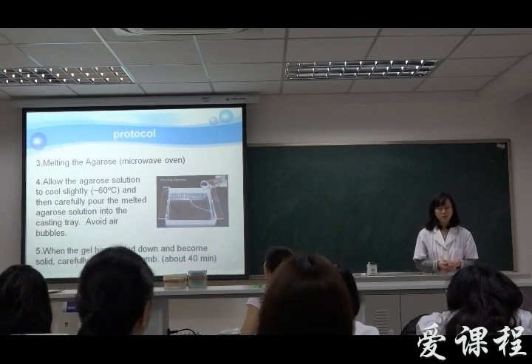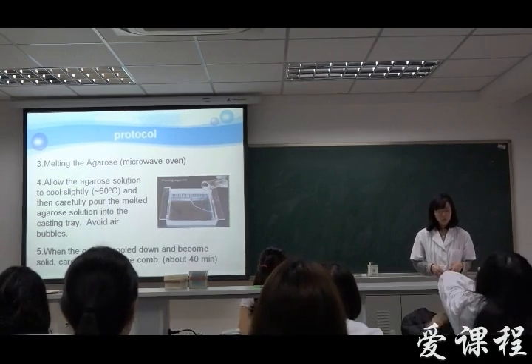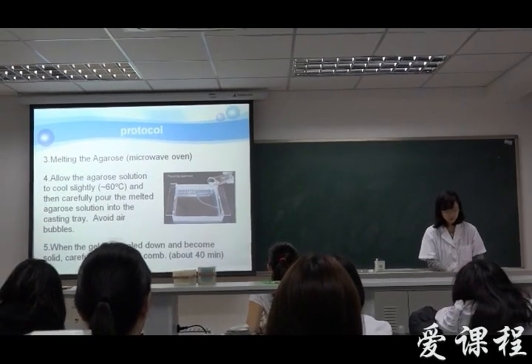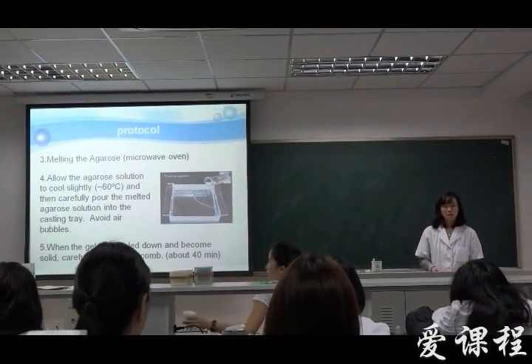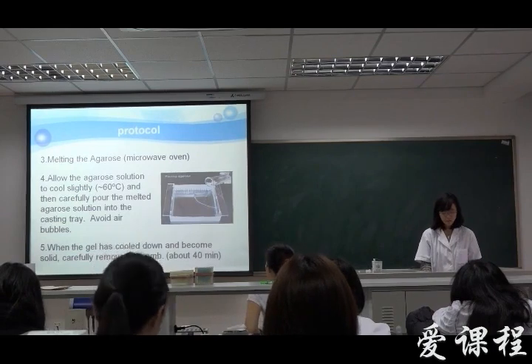We should wait for the gel to cool down and become solid. So I will continue our lecture first.